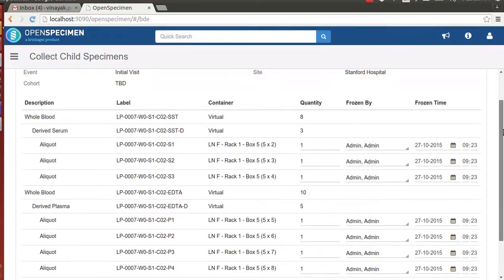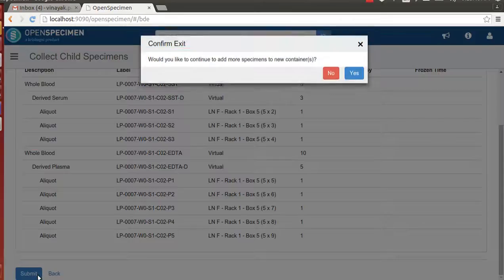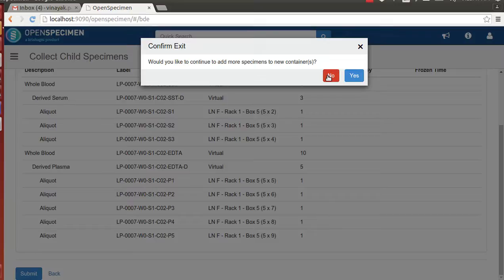Here we will input all the 5 plasma labels and proceed to the next step. The technician can review the positions that will be assigned to the aliquots and submit to OpenSpecimen for storing in database. At this point, we say we do not have any more specimens for whom to assign the positions.